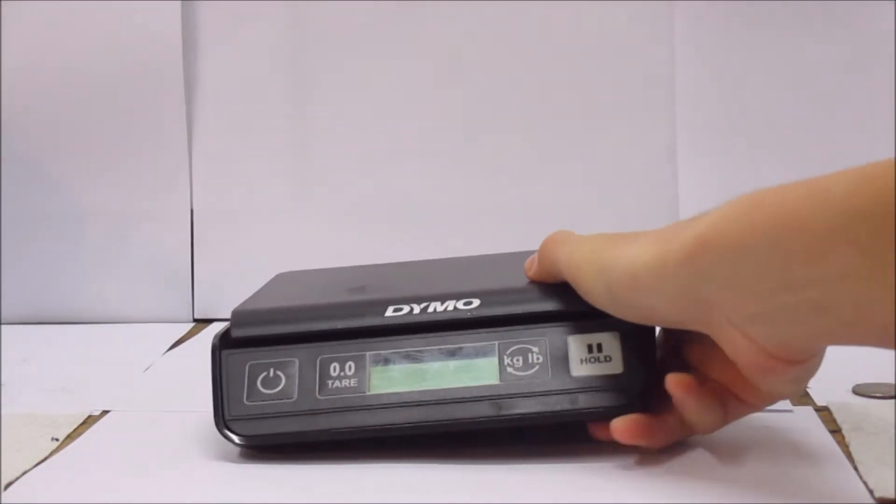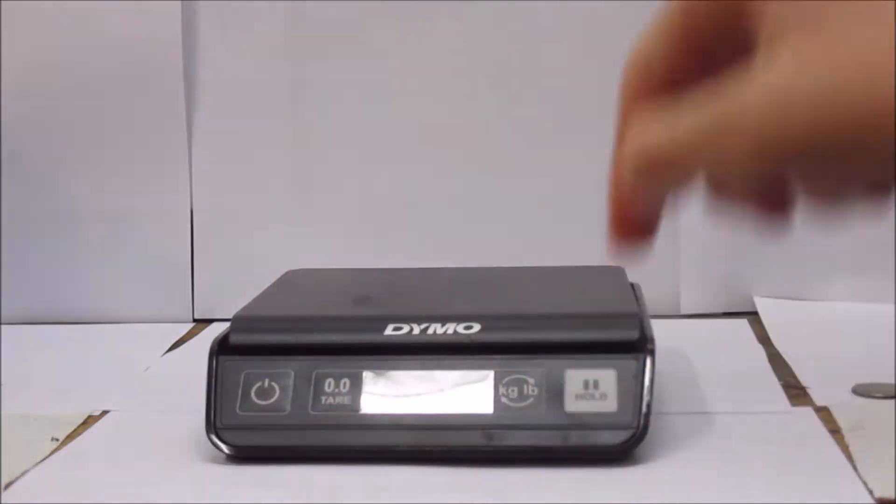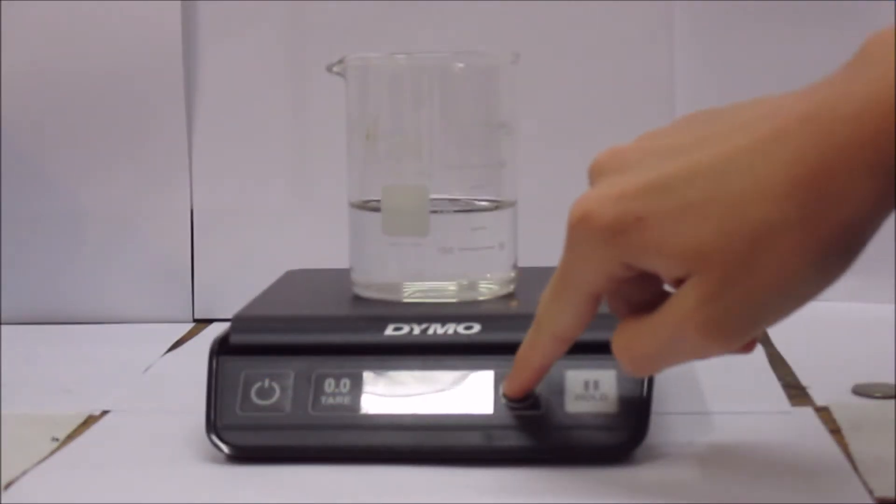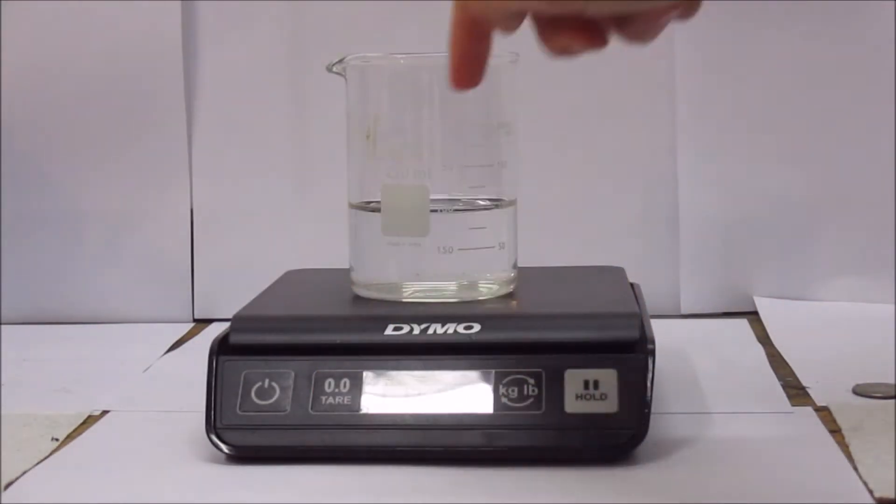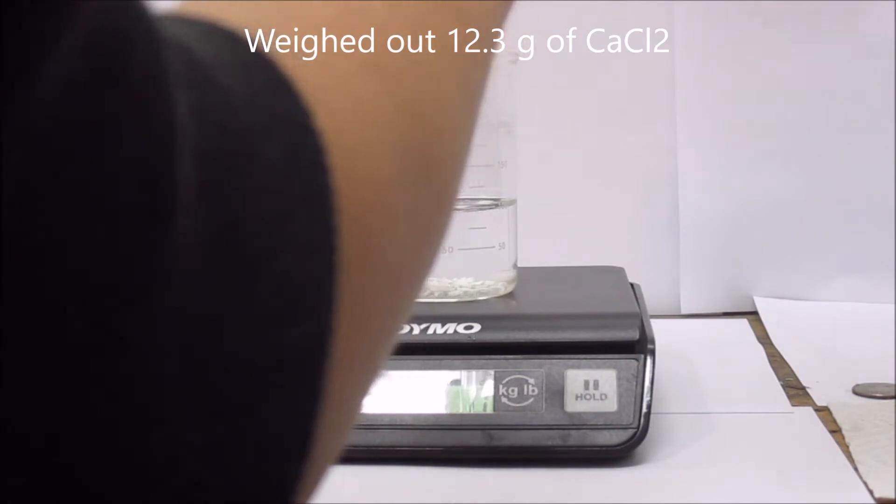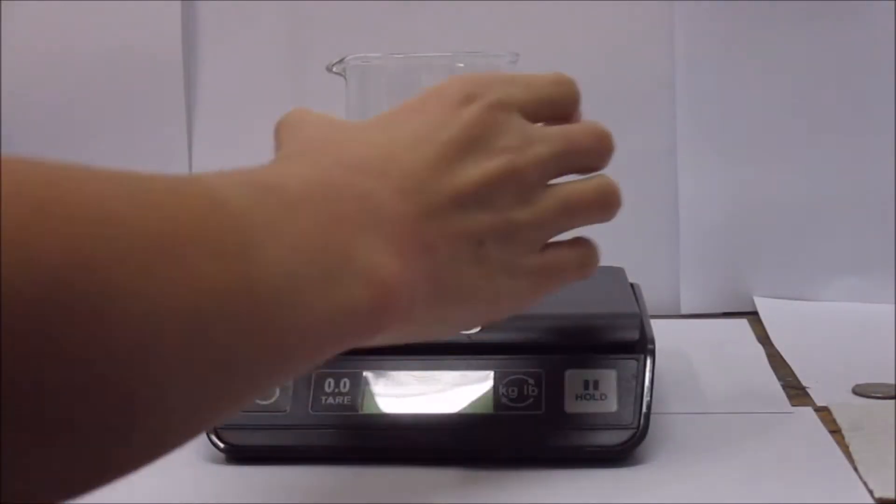Then I got out my scale. I placed the beaker on the scale. I then weighed out 12.3 grams of the calcium chloride. After that was done, I took it off the scale.